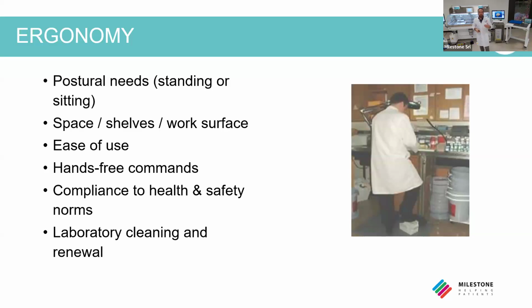There should be an easiness of use, and also a nice to have feature, which is the possibility to move the grossing station all around the laboratory. Why? Because there are several issues for cleaning. For example, the rear part of the grossing station should be clean.